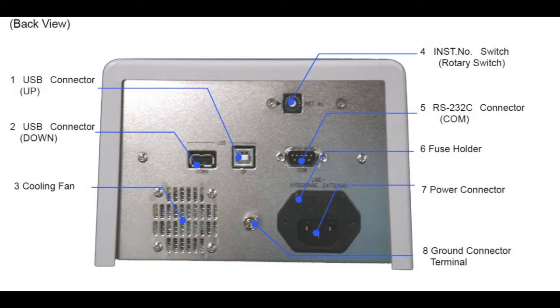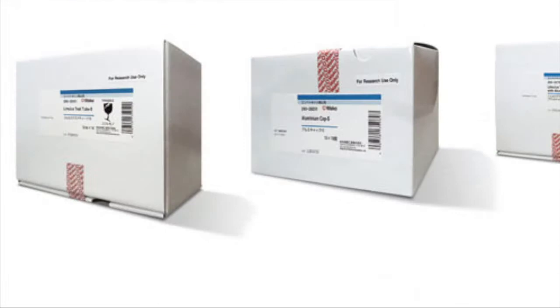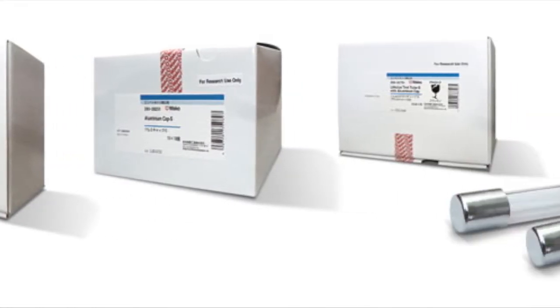The ET6000 is in compliance with all FDA guidelines, and the Toximaster QC7 software is FDA 21 CFR Part 11 compliant. To help support your usage of the ET6000, Waco Chemicals offers endotoxin-free pipette tips, endotoxin-free test tubes and aluminum caps.